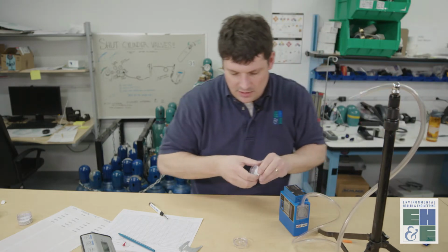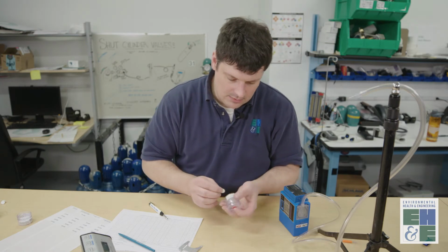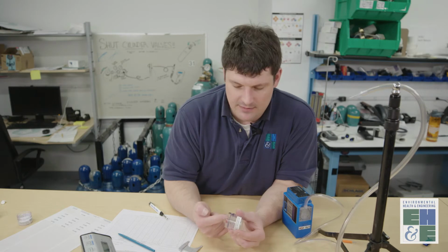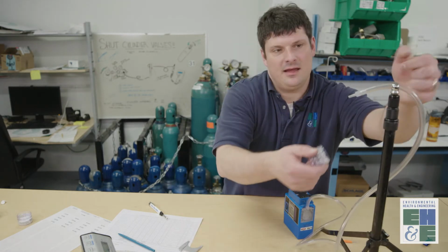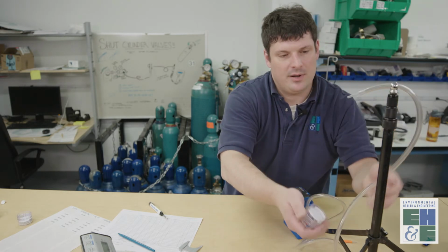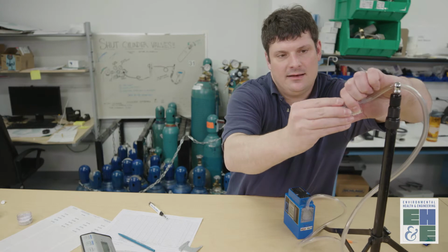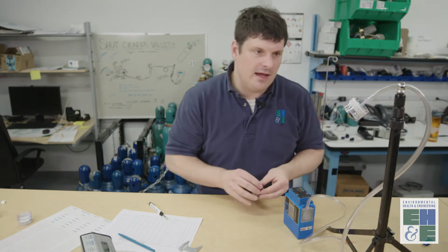It's important when you're doing open face sampling that you put your sample ID not on the thing that you're going to remove, but keep your sample ID on the bottom of the cassette. Area samples like this on a tripod would be collected at about a 45-degree angle ideally, whether that's an open face or a closed face cassette.